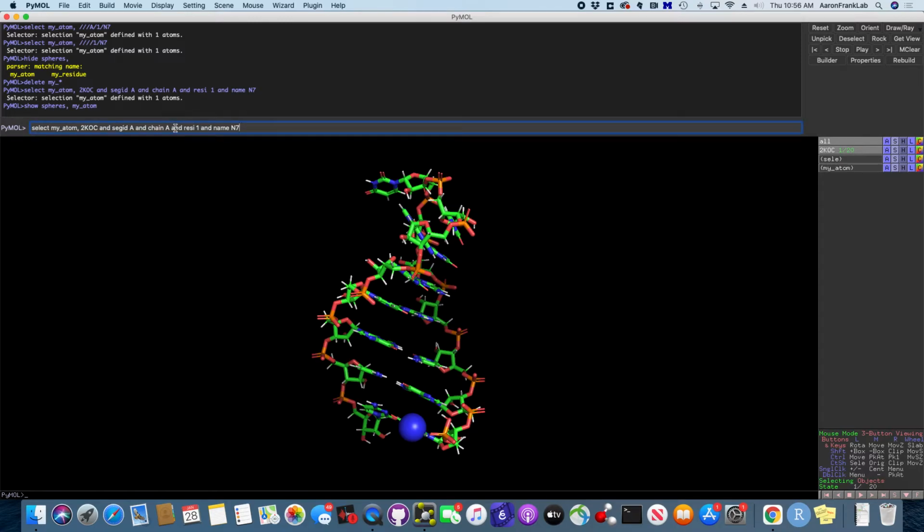I typically like this more explicit way, but you can see, look at this, I had to write out all of this. That's just how my brain prefers to do things, but it's not the most compact way. It's easy to read because you can tell exactly what's happening, but you might prefer doing it like this. So anyhow, let's go ahead and move on from selections.